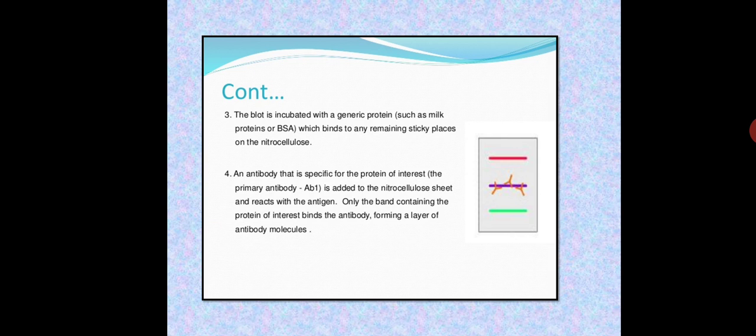Because it's protein. So we use a detector that can bind to our protein of interest. As a gene of interest is there, in the same way protein of interest is there, which we want to analyze, which we want to study or which we want to detect. तो यहाँ पर डिटेक्टर की तरह एंटीबॉडीज काम करते हैं, ओके. So we use antibodies instead of using probe.